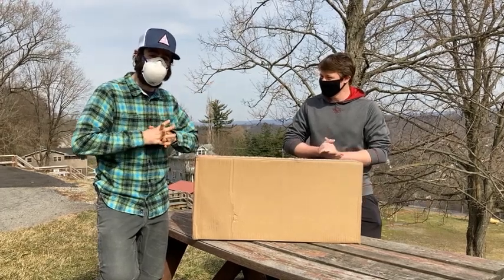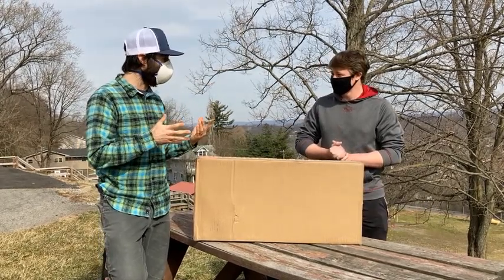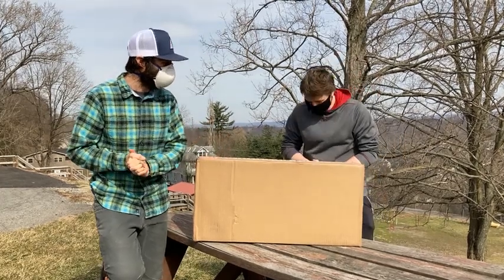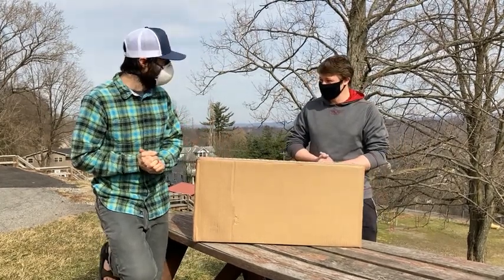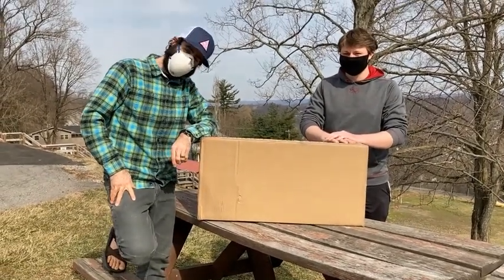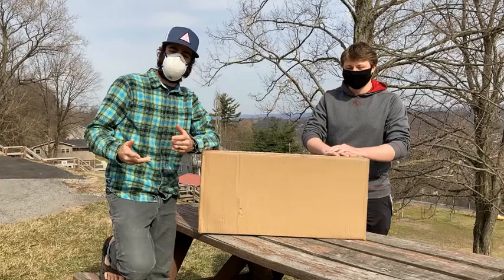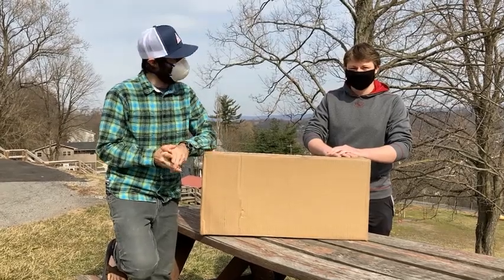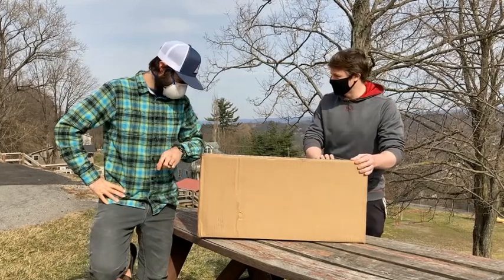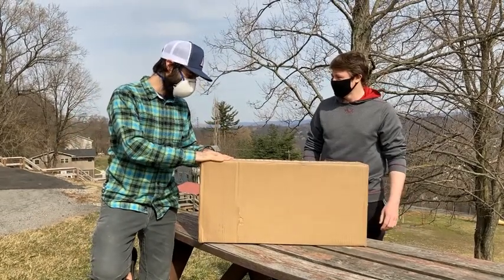I hear on YouTube the whole unboxing thing is like a thing — I still don't get it, but we're gonna give it a whirl. Howdy folks out there in internet world! I'm Brian, Executive Director from Friends of Decker's Creek. And I'm Jonathan, the Operations Manager. What do we get in the mail today, Brian?